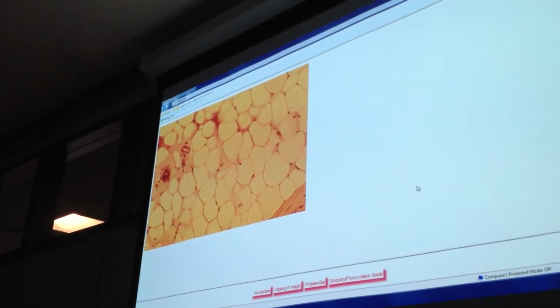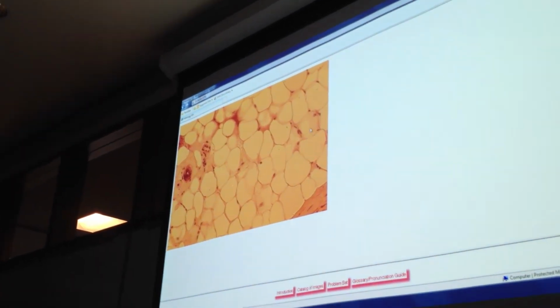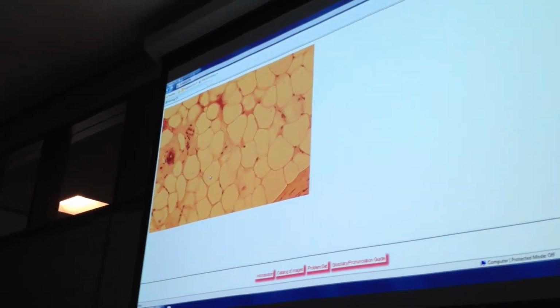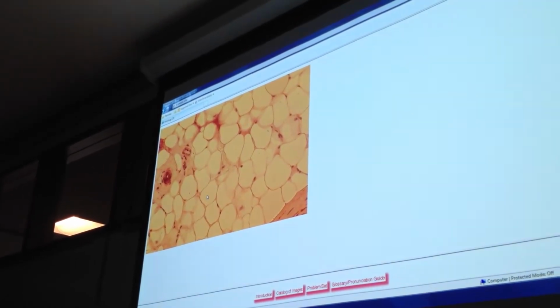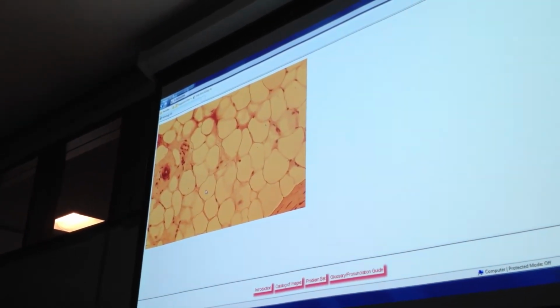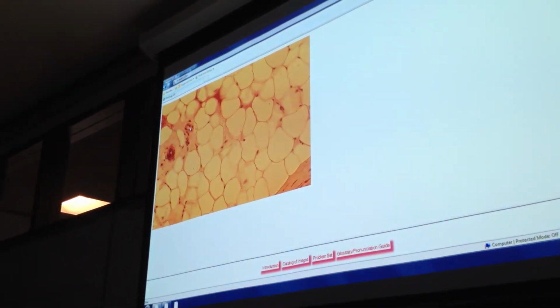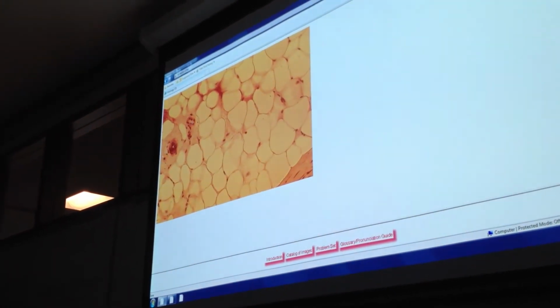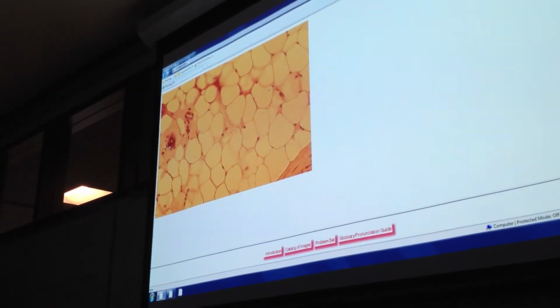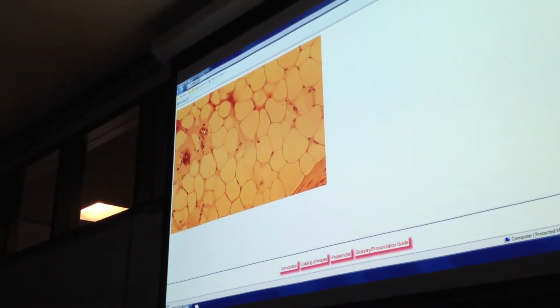What's that? Adipose. It always looks like that. Name that cell. Adipocyte. Predominant cell organelle. Fat vacuole. What's that? In general, what's that? Capillary. What's that? Small little arteriole. Cell type.